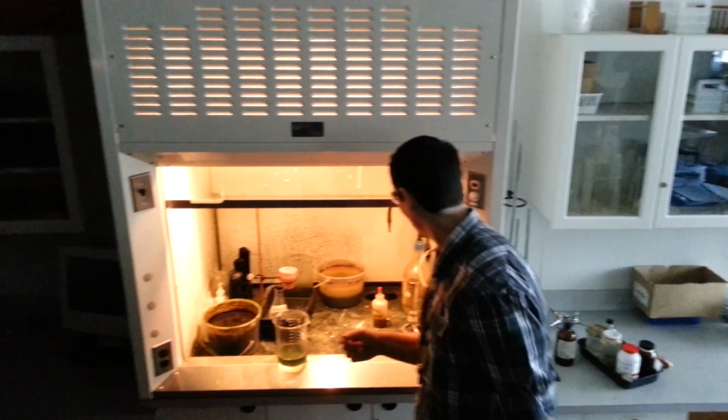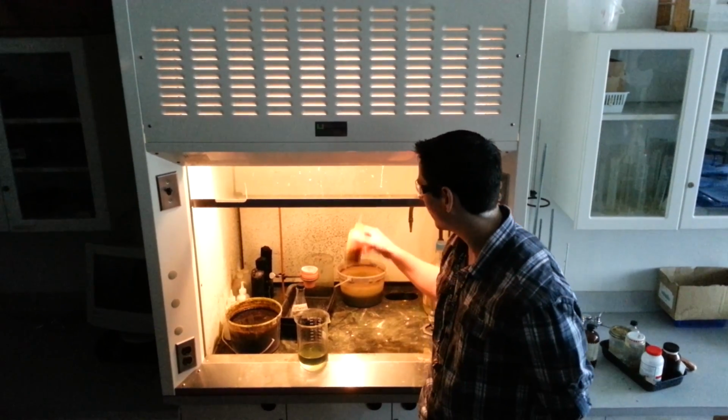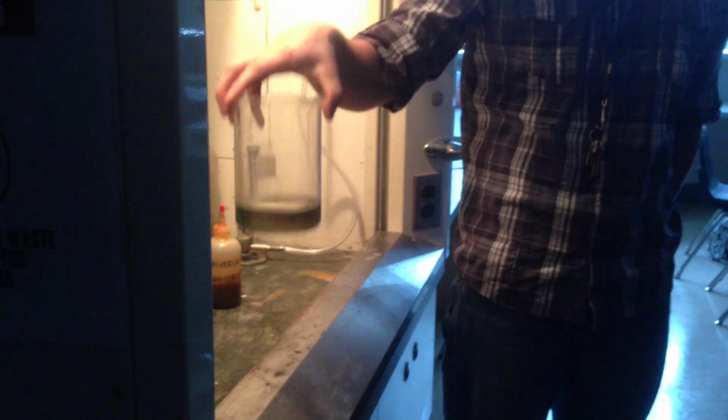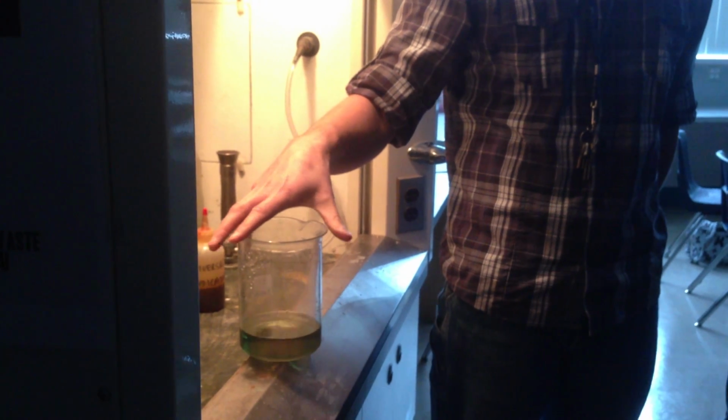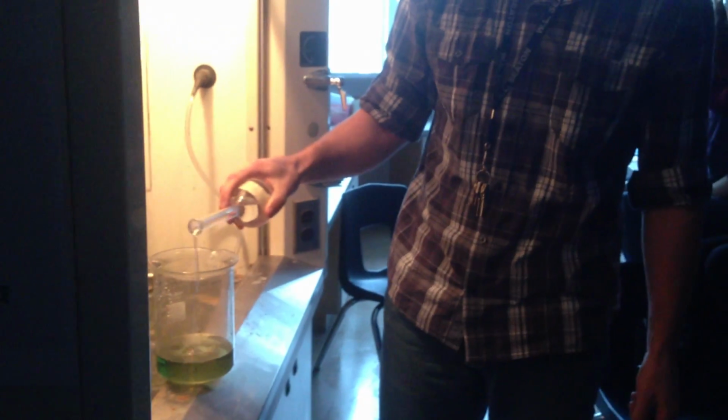And just to show you that these are basic, I took a bit of universal indicator solution and put it in some water. Universal indicator changes color depending on the pH of the thing that it's mixed with. We're recycling chemicals. Good times. So I just want to get this so that it's not as dark at the start.